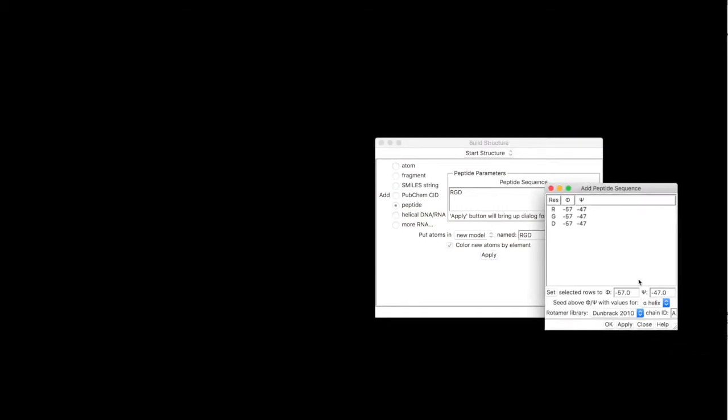The dialog appears, let's build a peptide that is stretched, let's choose the anti-parallel beta strand for the phi psi angles, let's select all the residues, click set.